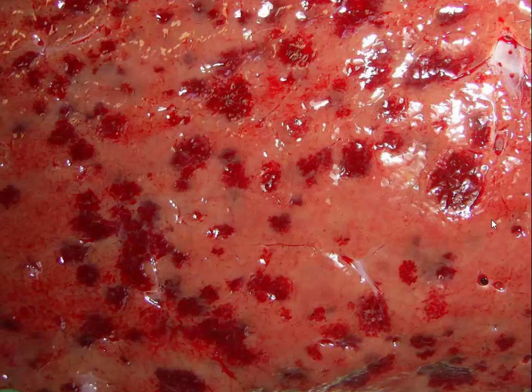A lot of people think that it might be due to previous bouts of sepsis and bacteria coming out of the GI tract through the portal system into the liver, causing some necrosis. And then those little areas slough away. Because of the presence of the blood, maybe they don't reform. You know, the liver can really regenerate. So it's always a fun lesion. A lot of people want to look at that and they want to attribute a lot of pathogenesis. They want to say, oh, it's hemorrhage or it's necrosis or something. But hepatic telangiectasis. Some people call it telange or sawdust liver.